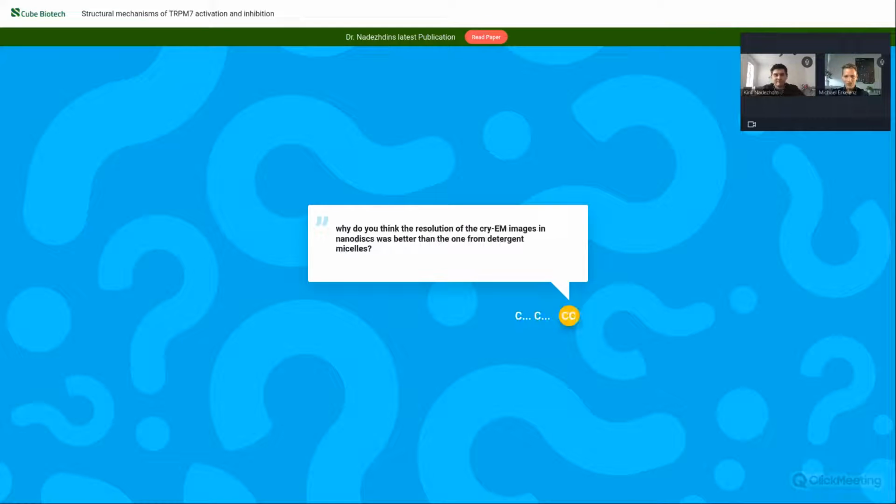Right. So the next question is asked by Carmen Castillo, and she's asking, why do you think the resolution of the cryo-EM images in nanodisk was better than the one from the detergent micelles? So I have two explanations for that. The first one is that the protein, at least I believe, maybe that is not true, is more stable in nanodisk than in detergent. And this gives you some bump in improvement of resolution. This is one reason.